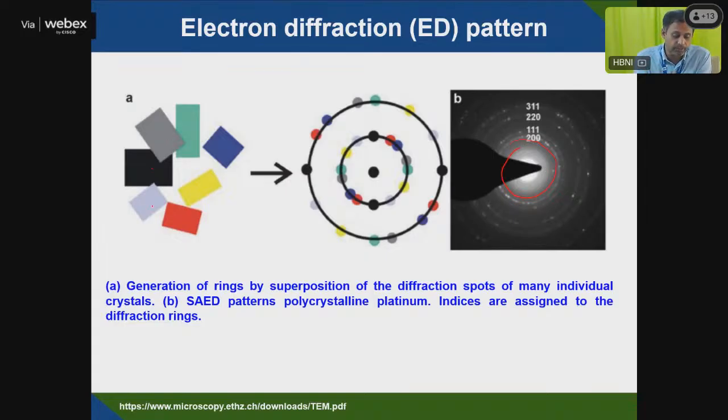So here there are multiple crystals. Each crystal has a sample, like this yellow crystal, which should also have a 110 plane. So the 110 plane is there.